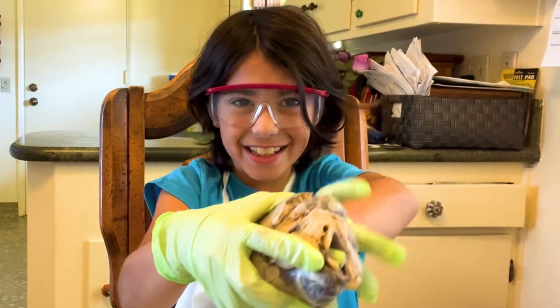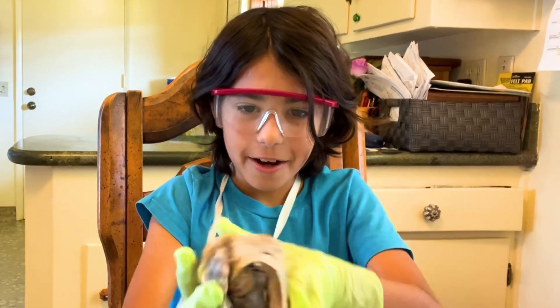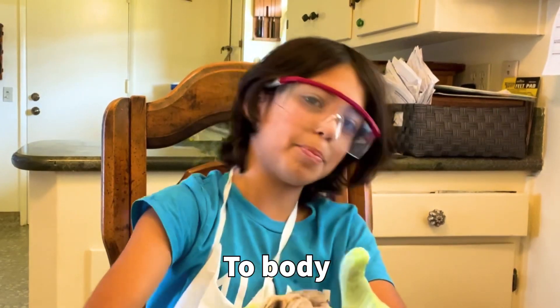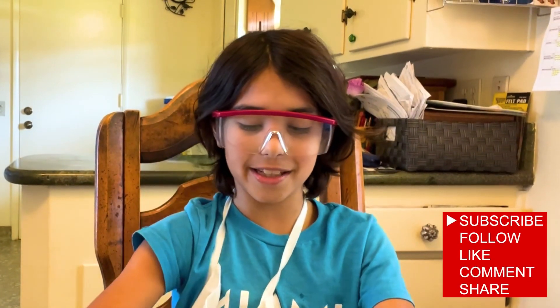My finger can barely even fit through this — trying to make it fit. Whoa! Okay. And then right here is the aorta. It shoots blood all over the body and lets your body move around. Thanks for coming over and learning with us at Lab Rat Academy.